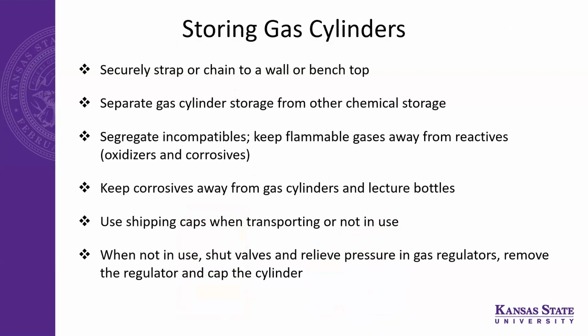Then the storing of gas cylinders. I have a couple of pictures after this. Securely strap or chain them to a wall or bench top. They should not be left loose. Separate gas cylinder storage from other chemical storage. Again, segregate incompatibles, keep flammable gases away from reactives, and keep corrosives away from gas cylinders.